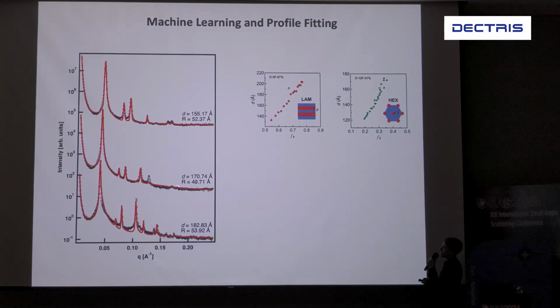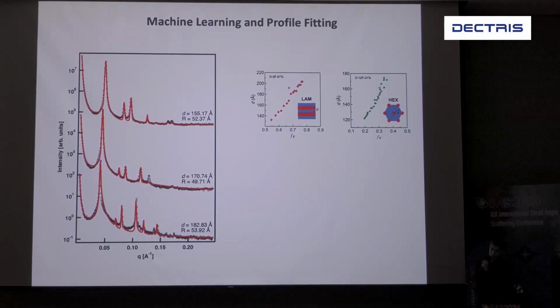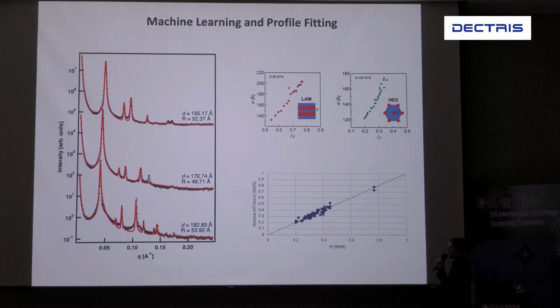Here is some basic output where you can see the d-spacing, the 4π over √3, as a function of NMR volume fraction. Something that's also cool is that not only am I able to measure the domain spacing, but I'm also able to measure the size of this radius to calculate how much volume this fluorinated block takes within the sample. I was able to compare that to NMR, and it matches NMR very, very precisely. So it's a cool way to show that you can gain a lot of information from SAXS, and you're able to use both Yuli's and my knowledge to help you with your data analysis.